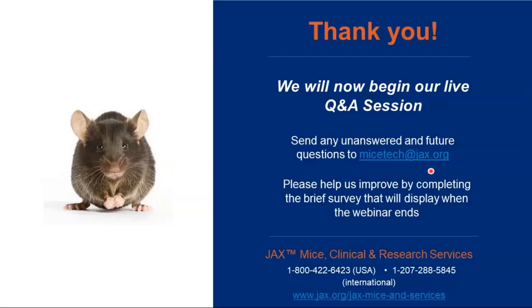All right, Pete, we got a lot of questions. We tried to answer as many as we could, but I've got a couple for you that I think would be really great topics to consider. One that we got a lot of questions on was the difference between breeding by pairs and trios. I wonder if you could comment on the benefits of each method.